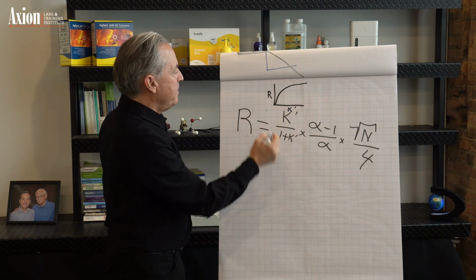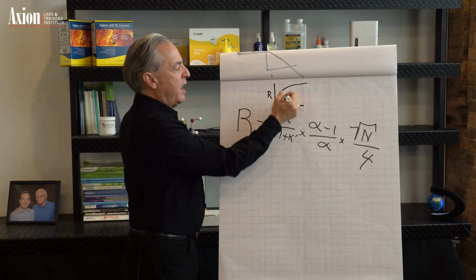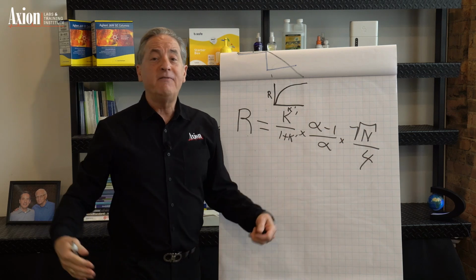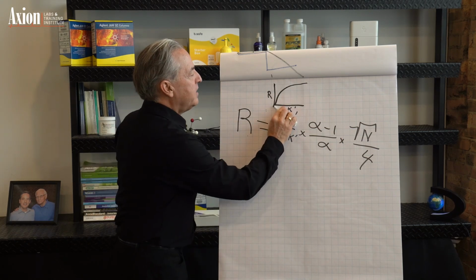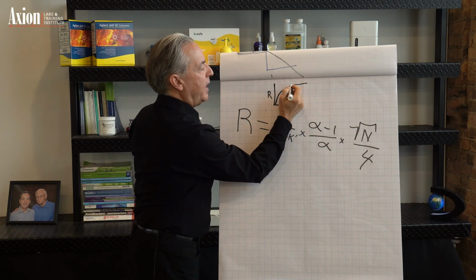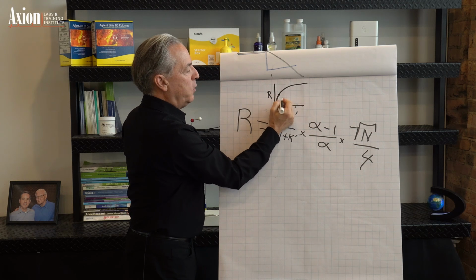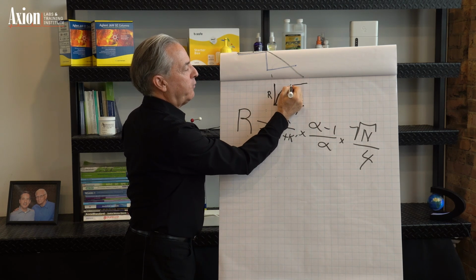So what does this tell you? If we want good resolution, now if I want the highest resolution possible, I would want the highest K possible, and that would take an infinite amount of time to do chromatography. Doesn't make much sense. But if you look at this curve, you're like, well, infinite would be great, but boy, I could get to 50% of infinite with a capacity factor of 1. And then I got 2, 3, 4, 5.